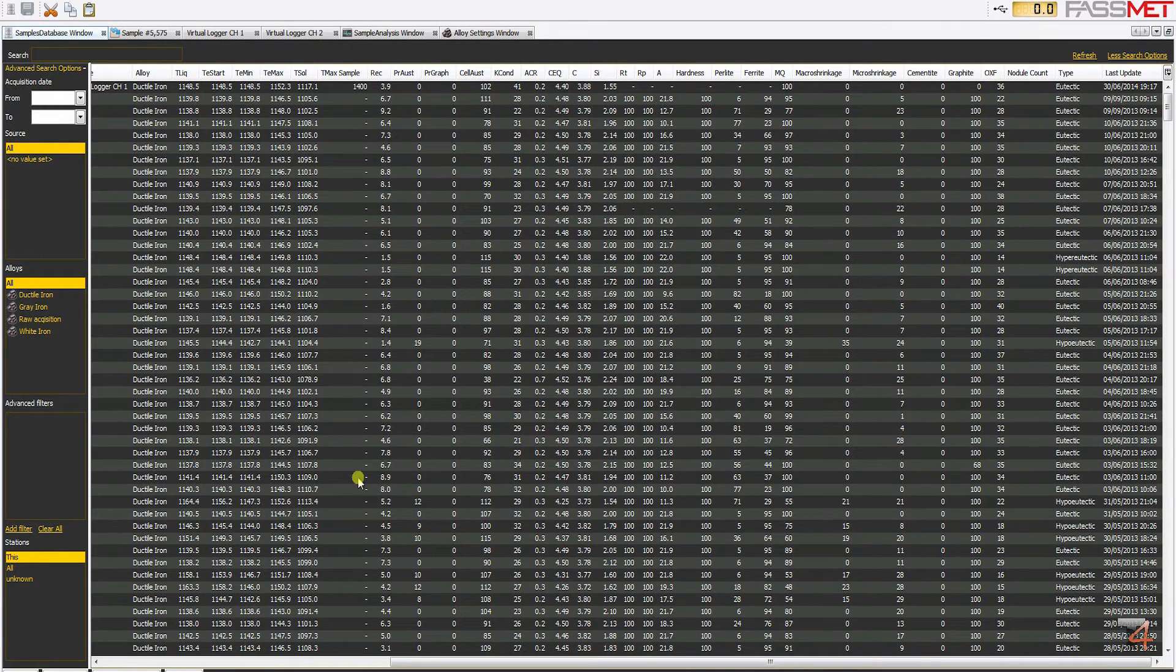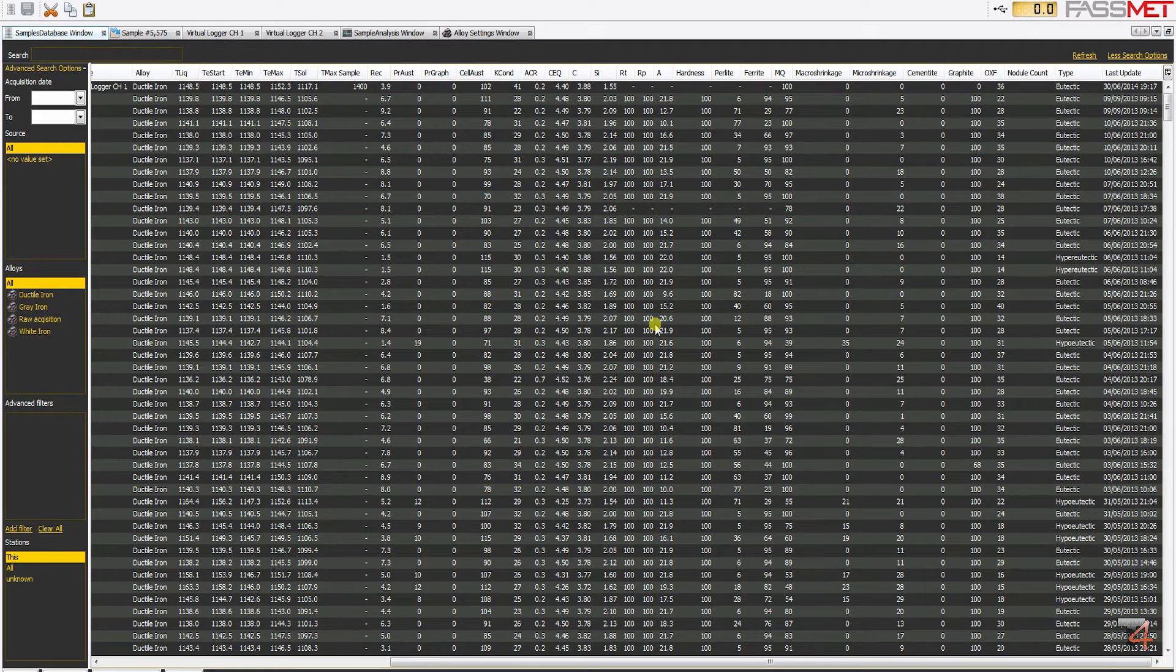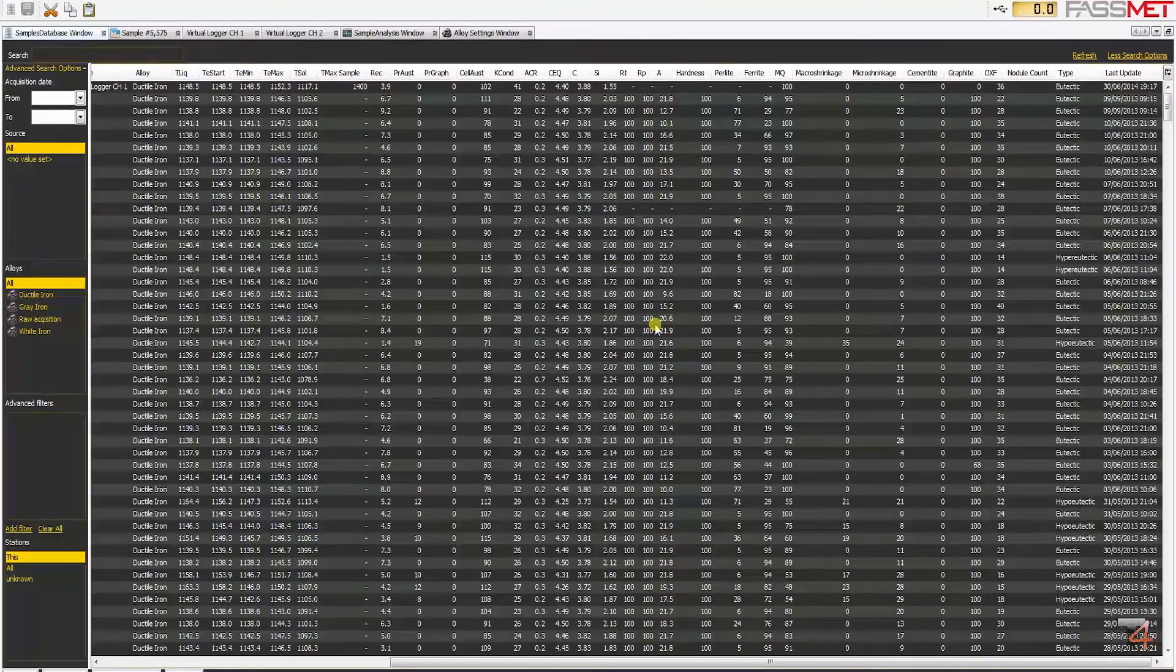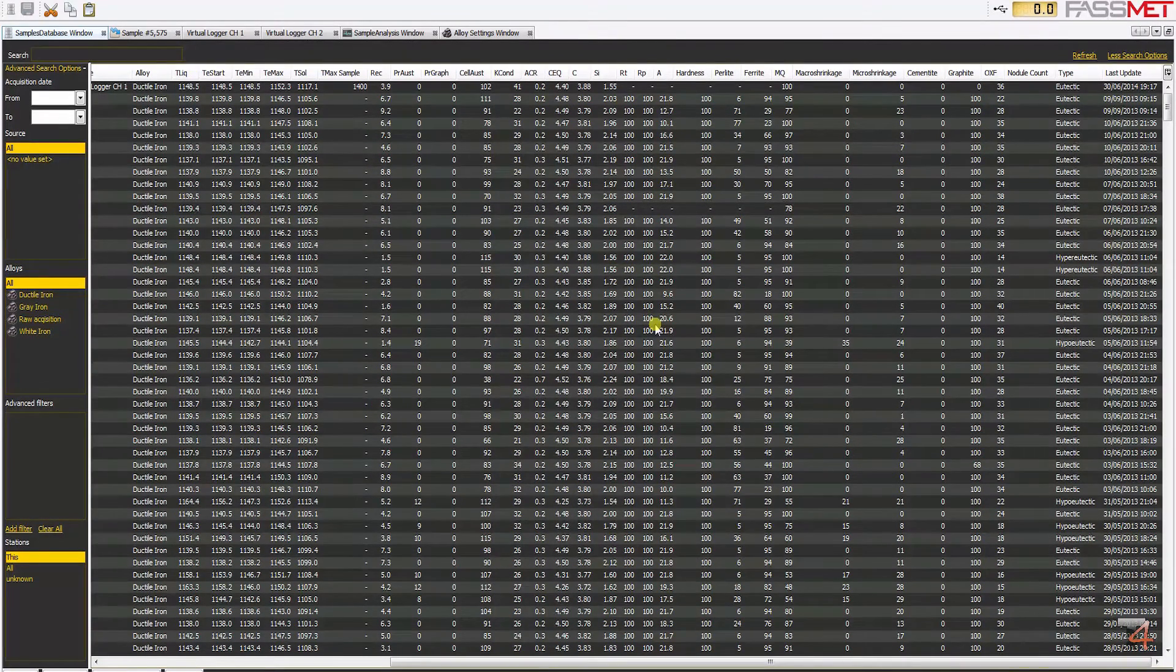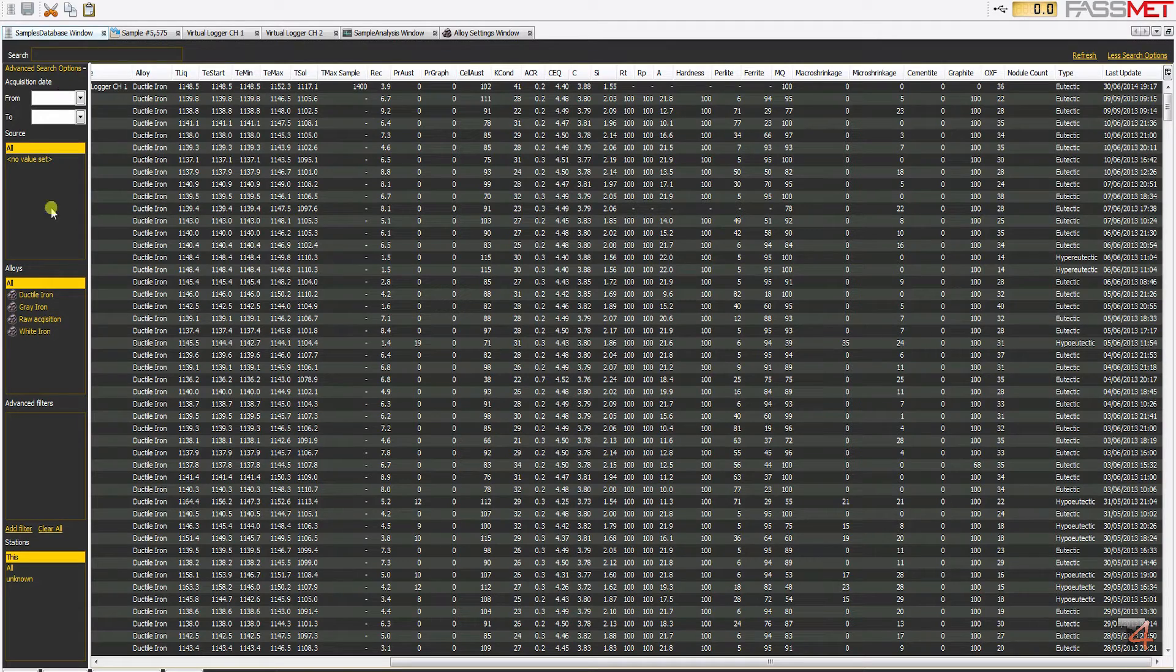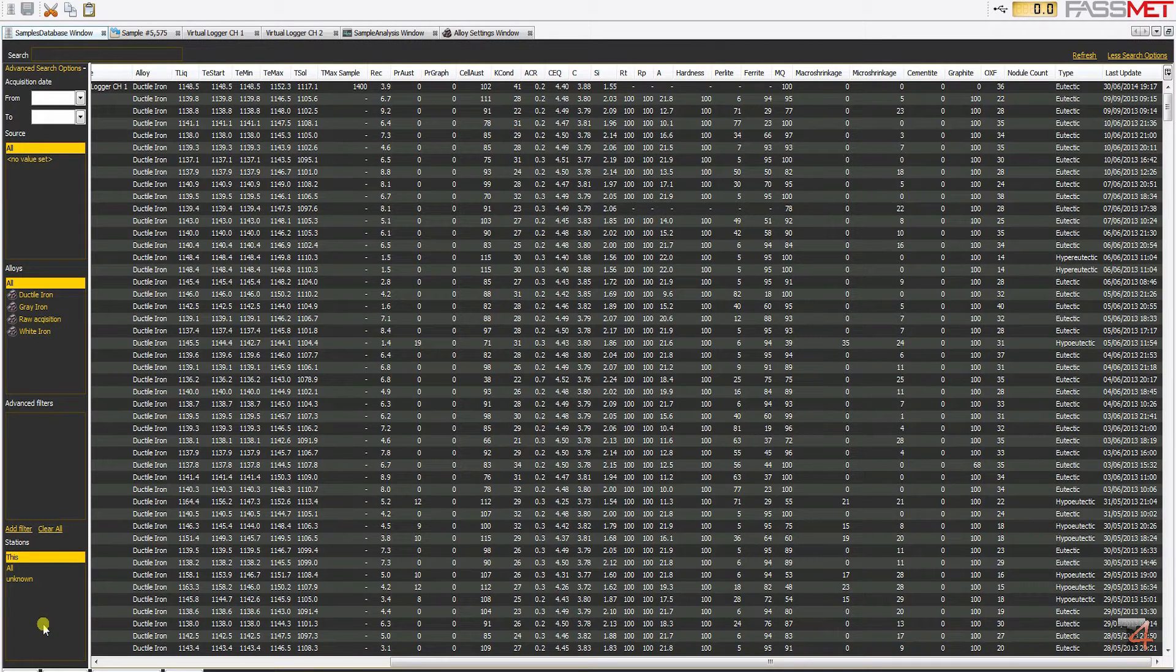Once completed, all sample acquisitions are automatically stored in the sample database from which foundry engineers can access advanced analytical settings such as the advanced search function and the comparison charts function.